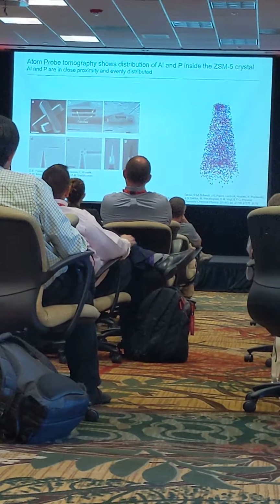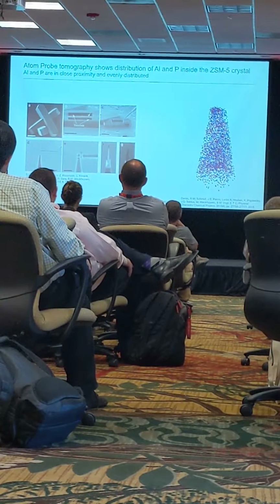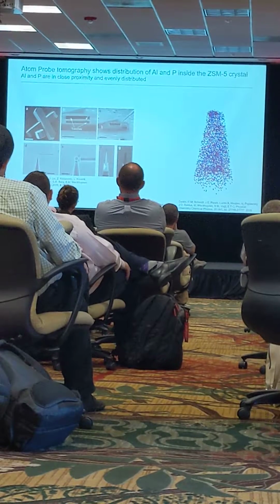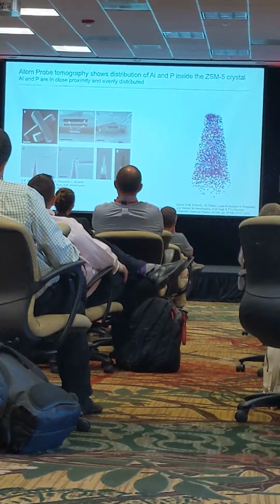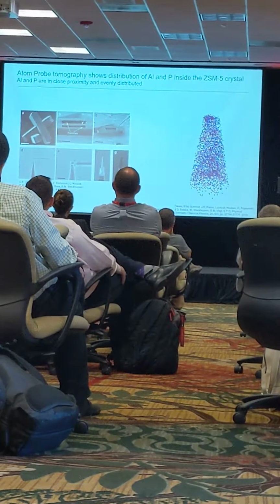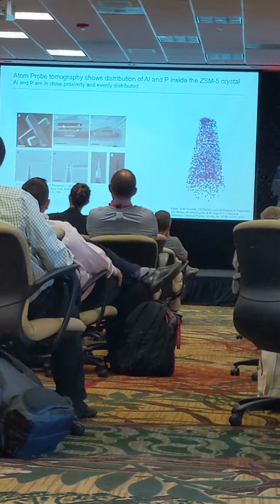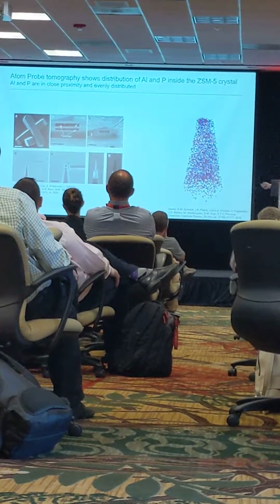So, big name. Let me walk you through the steps of how this works. It basically starts with a ZSM-5 crystal, which is shown in picture A. But in order to analyze it, we have to chop out a tiny portion. And in picture B, what you see there is the crystal after it's been hit with an ion beam that carves out a little lamella or trench. It's right there in the middle.